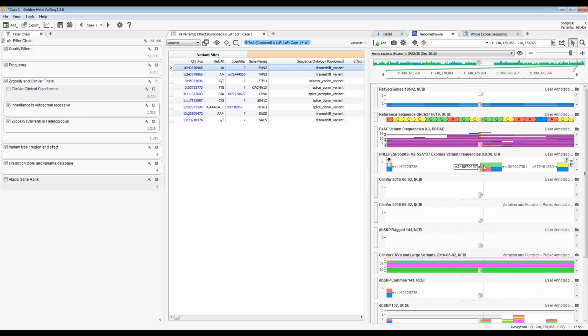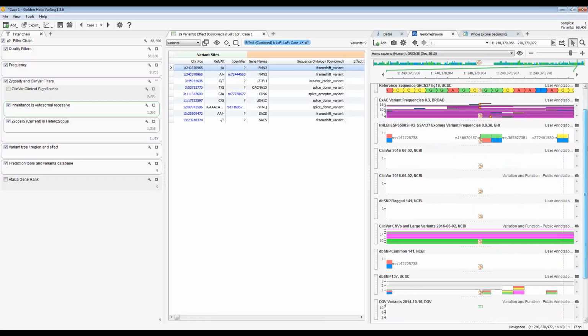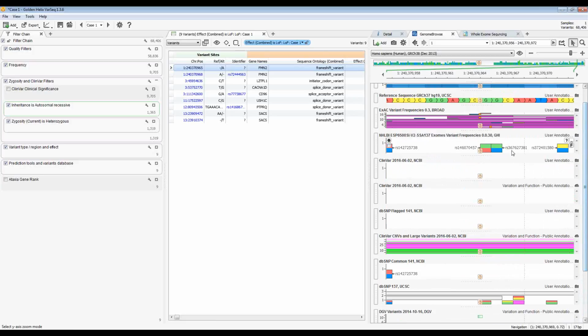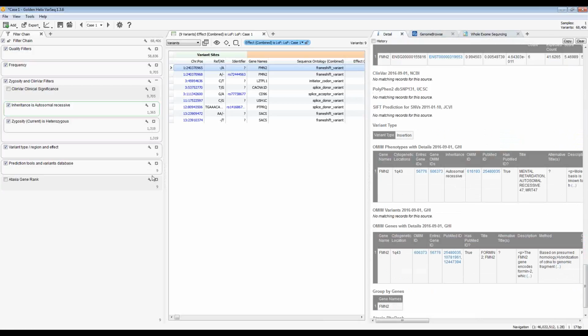We included the frequency, so for people who love visualization or visuals, you can have an idea about where you are, or if you are near an exon-intron junction, if there is a deletion or duplication in ClinVar CNV. It's just an additional tool that we sometimes use for visualizations, for additional information, if you don't like text.